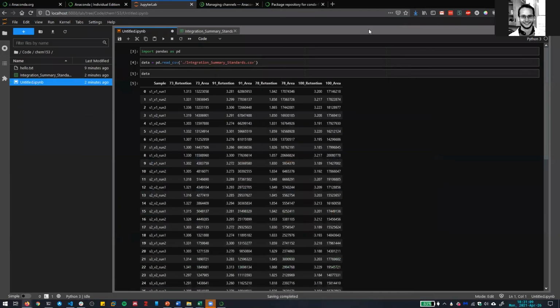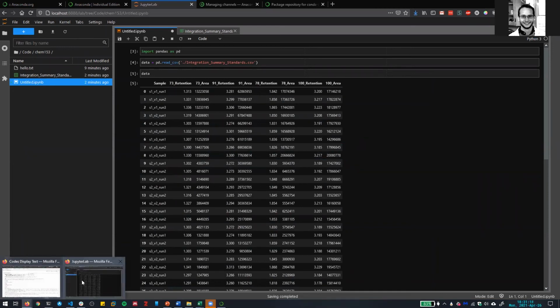Okay, so this is kind of where we want to get to today. And then I would actually like to have you guys download the code that I've been working on so that you have something to look at. I'll be updating this, so the version we download now isn't necessarily going to be complete, but I want to make sure that we can get this running as well. So let me grab the URL and I'll throw that in the chat.